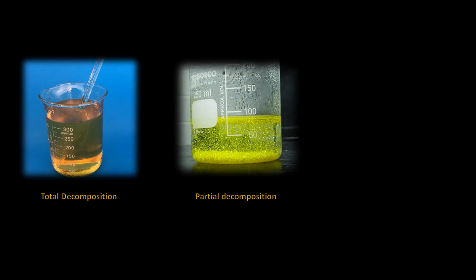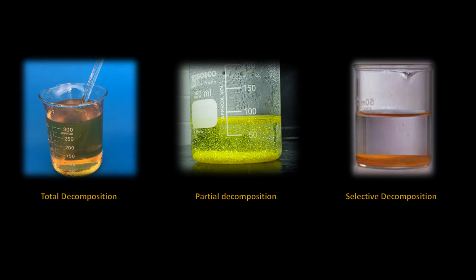Now, a partial dissolvement may be needed for analyte separation. Others will require a selective dissolvement to isolate the specific analyte. Some samples may need to be attacked using more than one method, such as a two-acid or a multi-acid attack, or using a wet-dry system of fusion, then followed with an acid.